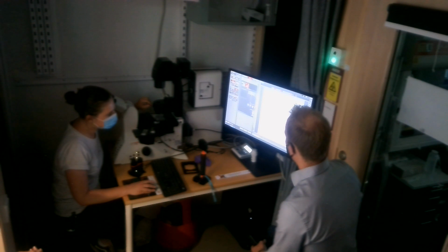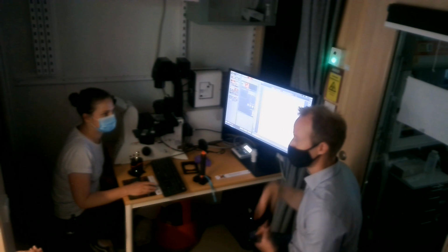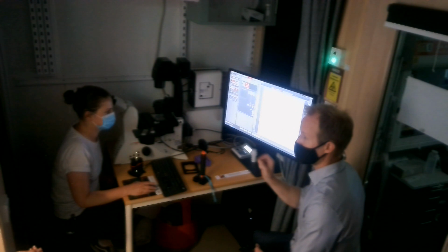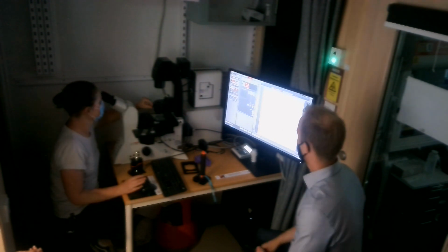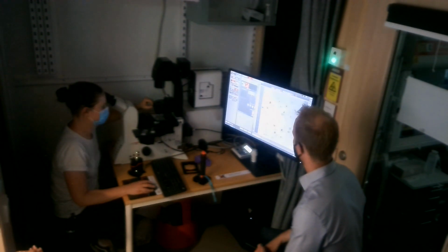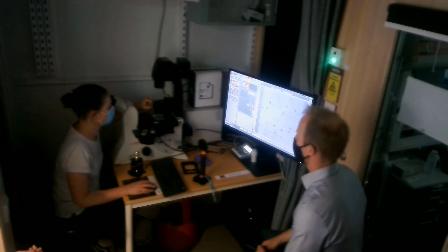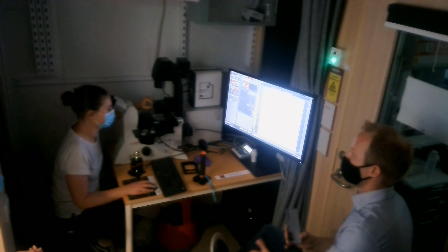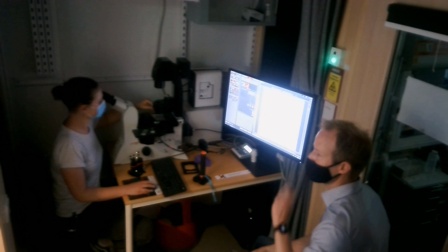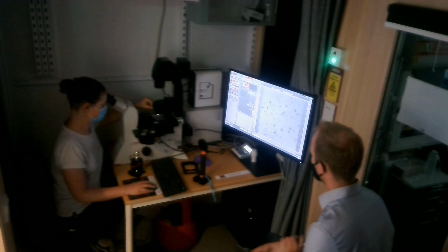With Brightfield images of live cells with no phase contrast or DIC, sometimes they can be difficult to see. So you might benefit from increasing the contrast with the Brightfield using the aperture diaphragm. That will give you a bit more contrast. And then when you open it back up, you have to compensate for that. But as I said, for me, around 7 for the 40x was the rule of thumb, sort of open for 70, 80, and then anything else is up for whatever you want.